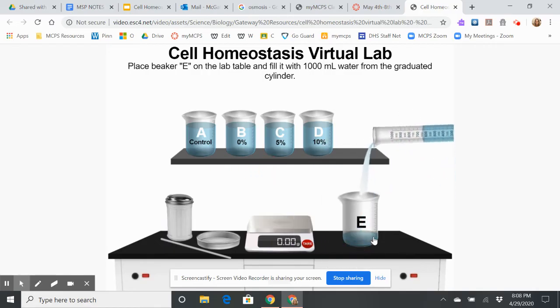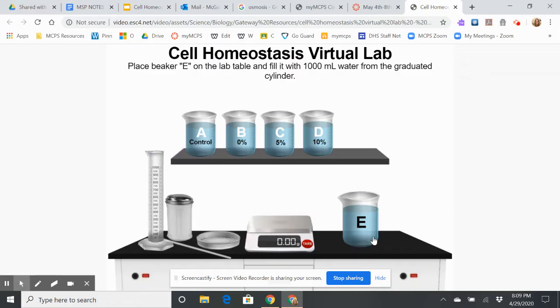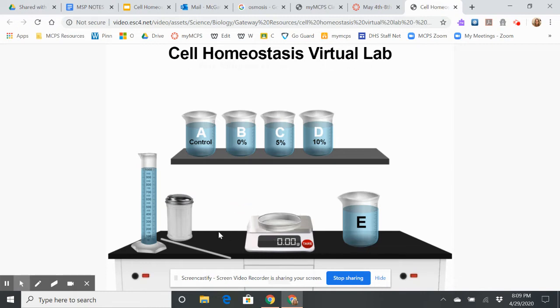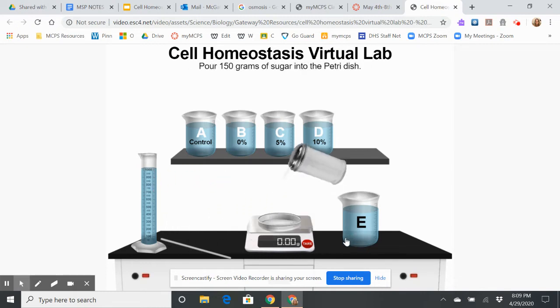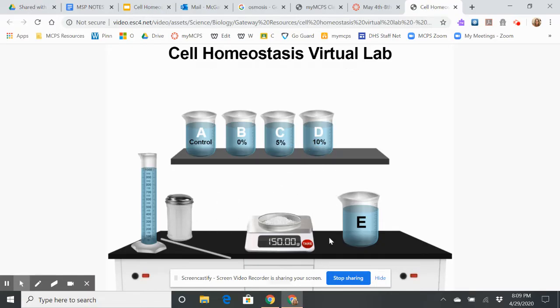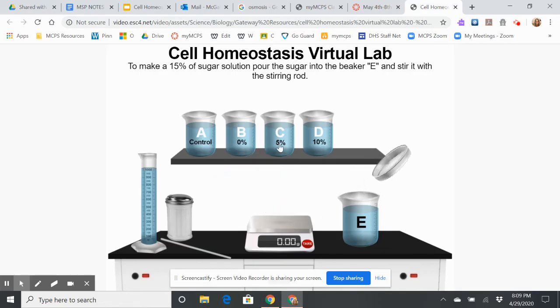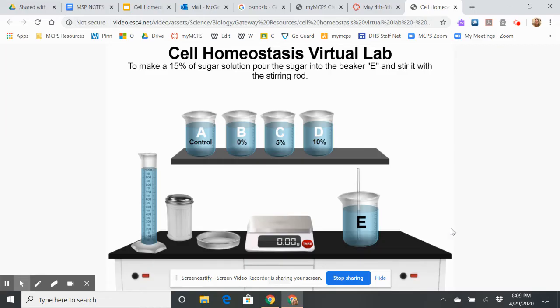Now I'm adding 1,000 milliliters of water to beaker E. I'm weighing it, zeroing the balance, and adding 150 grams of sugar. This is going to be my most concentrated solution because it's got 150 grams of sugar in the water, whereas beaker D only had 100 and beaker C only had 50. I'm going to stir it up so the sugar molecules are dissolved and evenly mixed.